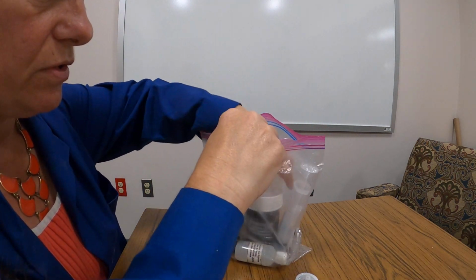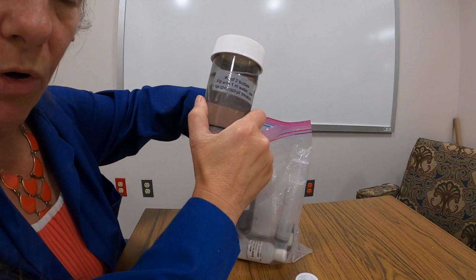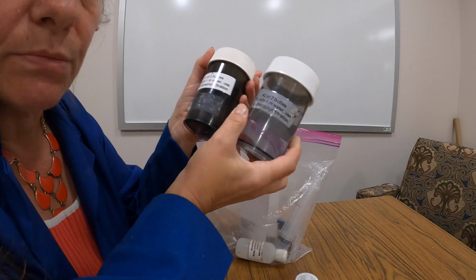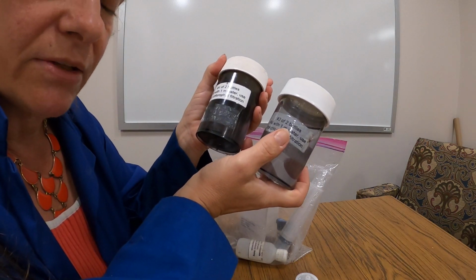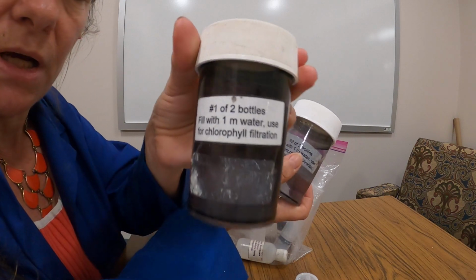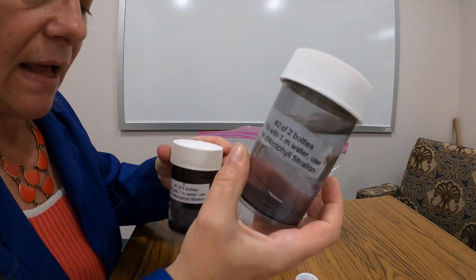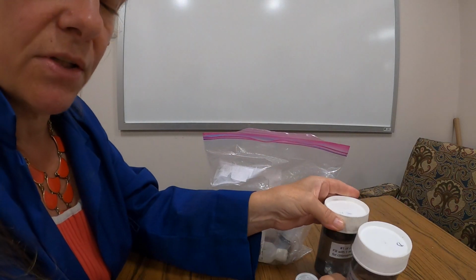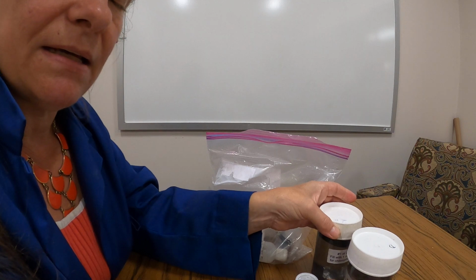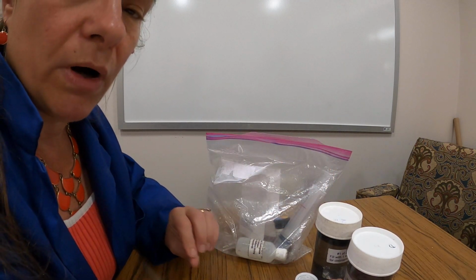You will have 2 bottles. These wide mouth bottles are what we call our workhorse bottles, because you're going to bring them out with you every other time you go monitoring and collect 2 samples. So the bottles are marked 1 of 2 and 2 of 2, and that's to remind you that you want to collect 2 samples at the same date, the same depth, and the same time. And you'll use your water sampler.